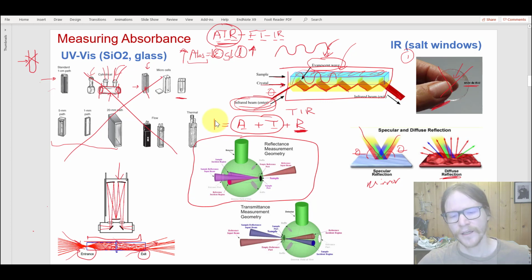They're really common. So the whole object is essentially this opaque thing that's rough. You put your sample in on the other side here. Your incident light comes in through a tiny pinhole over here, and then it reflects off of your sample, and then it can bounce around this sphere. And then eventually that light will reflect back up to where the detector is as it bounces around enough, and so we're collecting all of that light. That's really what the integration sphere is.